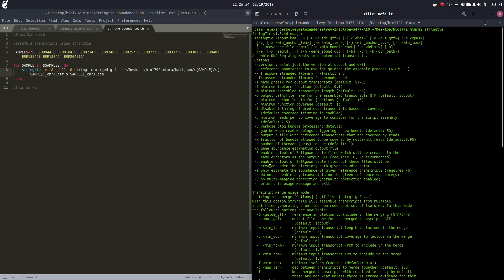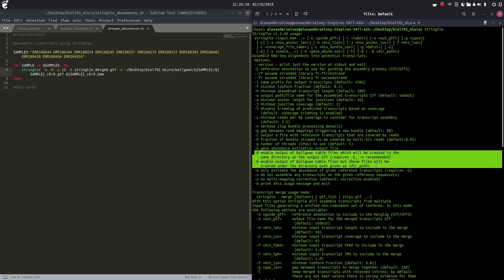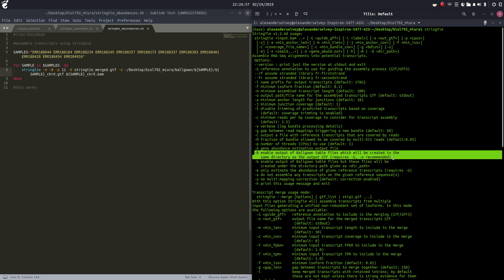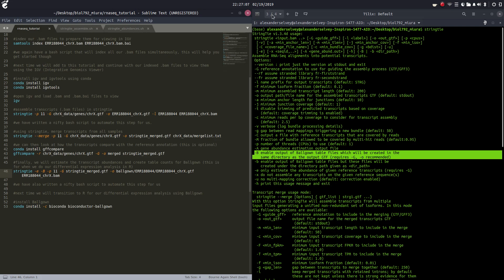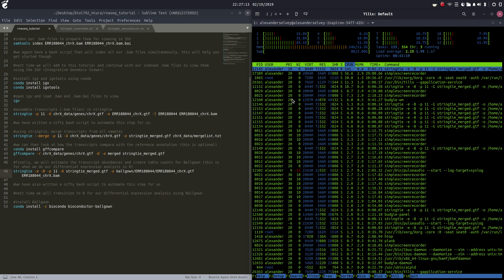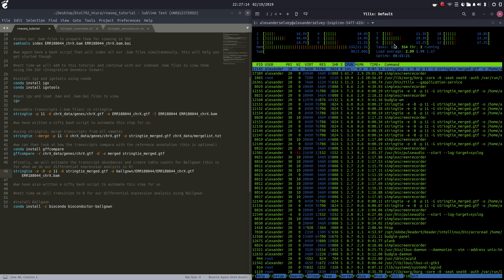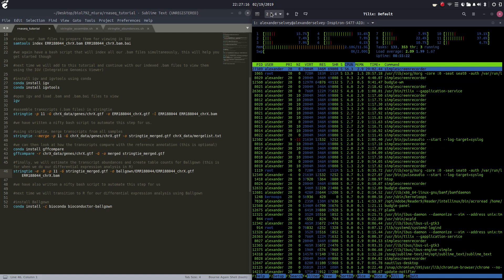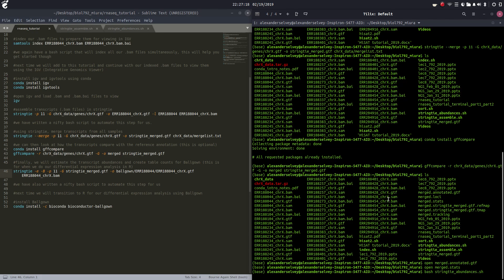Using -B, enable the output of Ballgown table files, which will be created in the same directory as the output GTF. I'll show you guys what those look like momentarily. Our bash script is running - jump over to htop to show you that it's working on it. It'll be done in a couple of seconds.